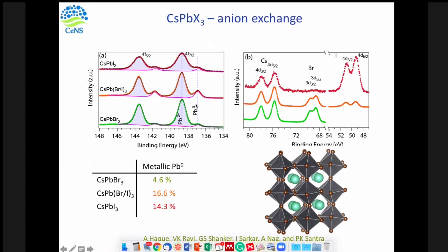Another thing is that you are choosing, say, one s orbital and one f orbital. Now s orbital and f orbital will interact differently with this synchrotron light because they are polarized, correct? So that also one needs to consider. If one would like to have a very precise measurement, then they should also choose similar types of orbitals. In this case, you will see that we have primarily chosen the d orbitals in all these cases. Sometimes that can be important, although it has a minor effect, but one should consider that. Yes, you got to pay attention to it for sure. That's interesting. That's not something I would have thought about, but that makes a lot of sense.